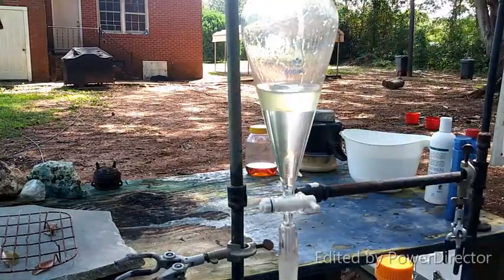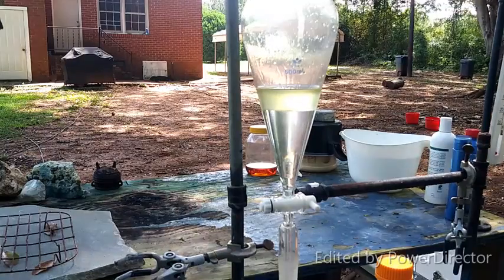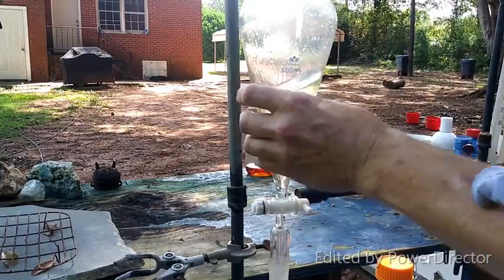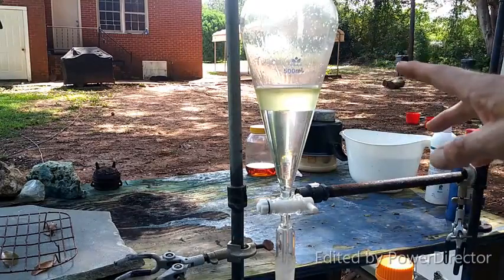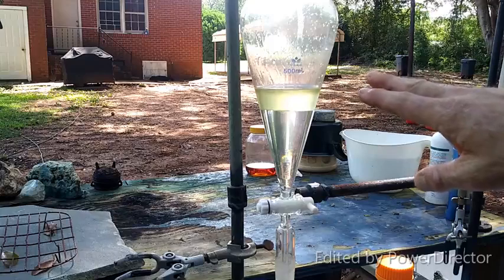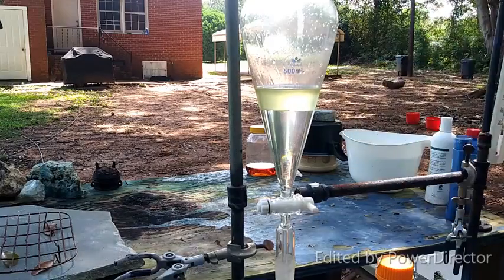Okay. Alright, let that separate here for just a second. Now we need to draw off the water layer. Once the ether layer is dried, we can evaporate this, and then once the ether has been evaporated, it says to fractionate our product under reduced pressure.